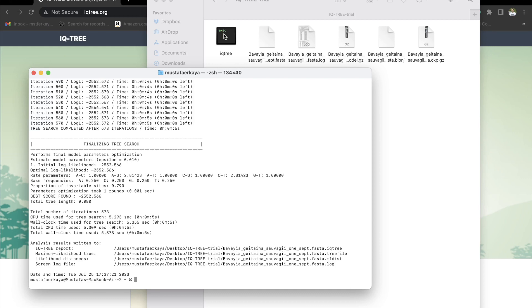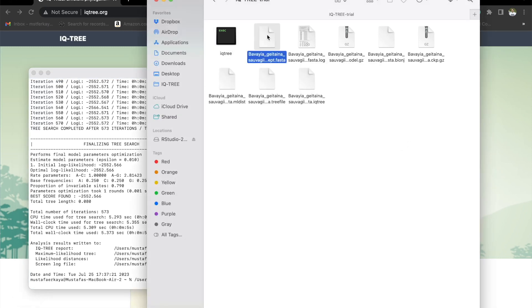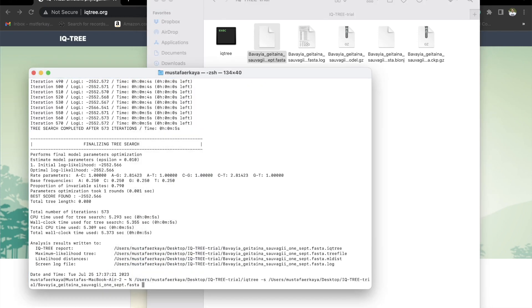Now again, we're going to repeat this process. Drag the IQtree, leave a space, write down -s, find the FASTA file, drag it down as well, and then go -m. Now paste the method. And then type in -bb 1000. BB stands for bootstrapping, and the 1000 stands for how many replicates it will have. To create a rapid bootstrap value, we're going to be using 1000.